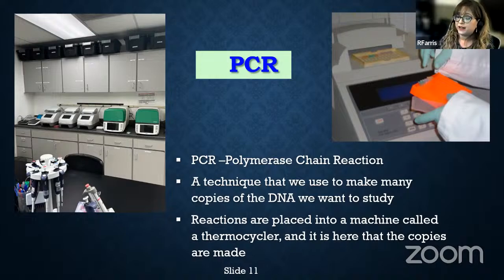So once we extract the DNA from an insect pest, we apply that DNA to PCR, and PCR is basically a copy machine for DNA. And it's just going to make millions to billions of copies of a single strand of DNA. And I will mention it's not the entire genome of the insect, but it's a certain section of the genome.